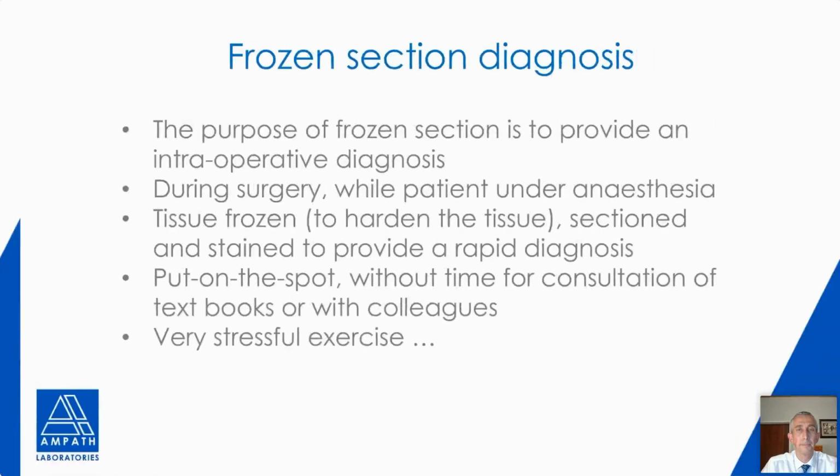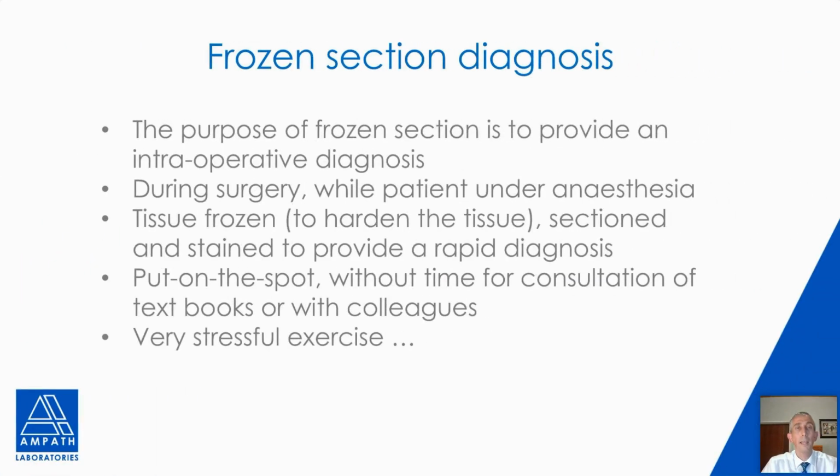I would like to end then by just mentioning something about frozen sections. The purpose of a frozen section is to provide an intraoperative diagnosis. This occurs during surgery, as many of you may know, while the patient is under anesthesia. The sample tissue is frozen in order to harden it, very much similar to the wax, although we do not have that available at theatre. So the tissue is in a frozen mold. It is sectioned and stained, and we provide a rapid diagnosis.